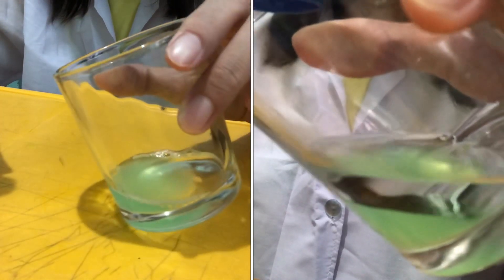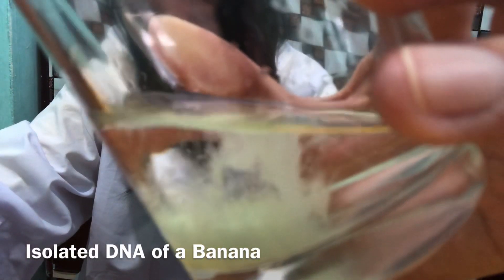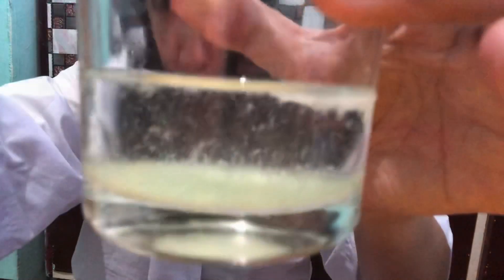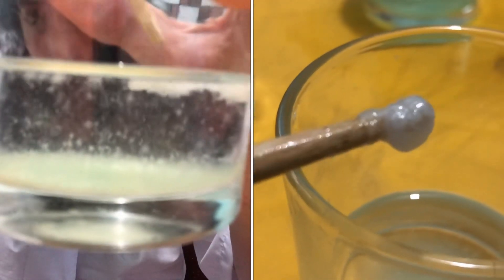We have to do it gently, so I'm going to tilt this container a little. As you can see, there is a white material that has emerged from our solution — we can use this stick to get our isolated DNA from the banana.